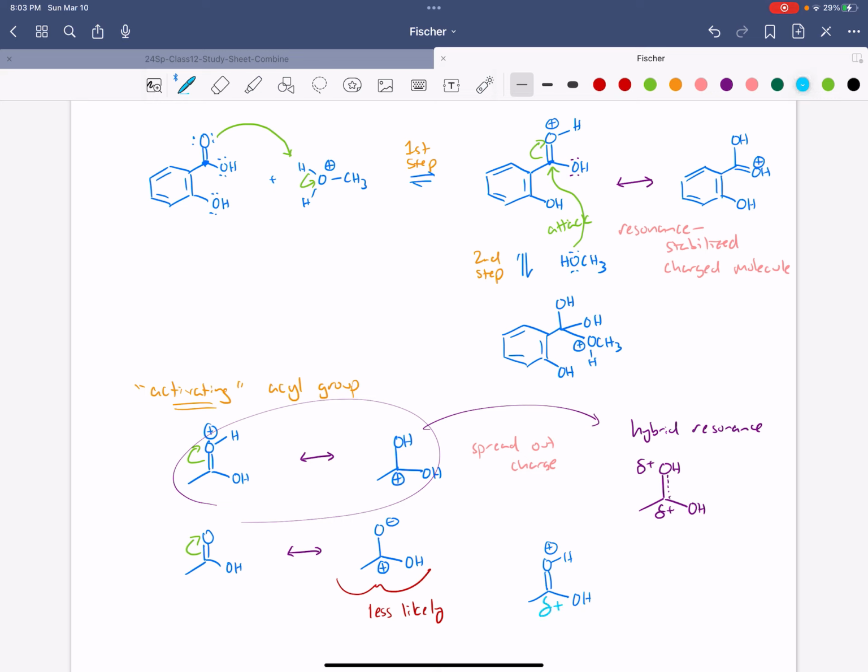Okay. So on your own time, try to finish the other 4 steps of the Fischer esterification. Next, I want to talk about purification. And purification mainly via an acid-base extraction, because this is where people are not understanding how these molecules are being separated from their impurities. That's a huge part of lab, to not only make the molecule, and I feel like in lecture you're getting a lot of mechanisms, so you know how the molecule's made, but lab is the only opportunity for us to understand how molecules are purified. You want pure stuff, right?